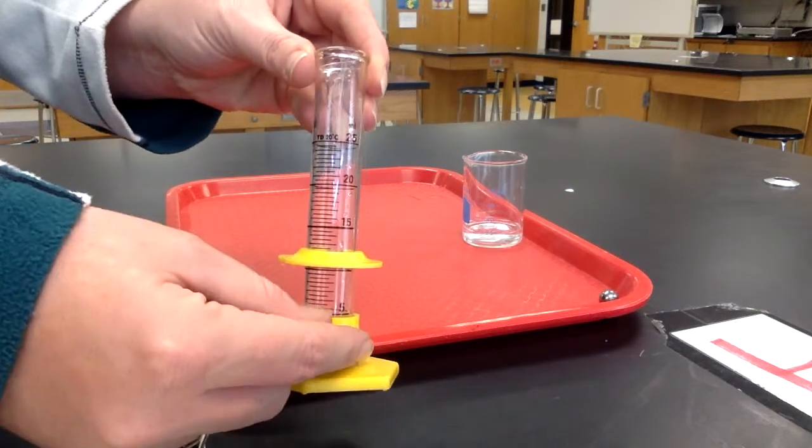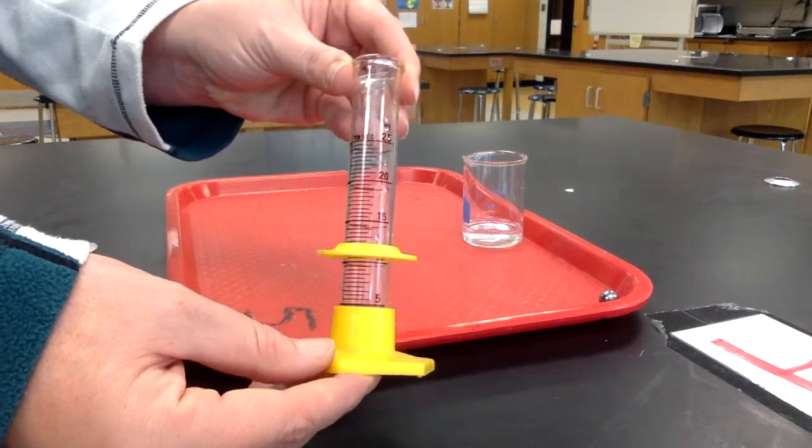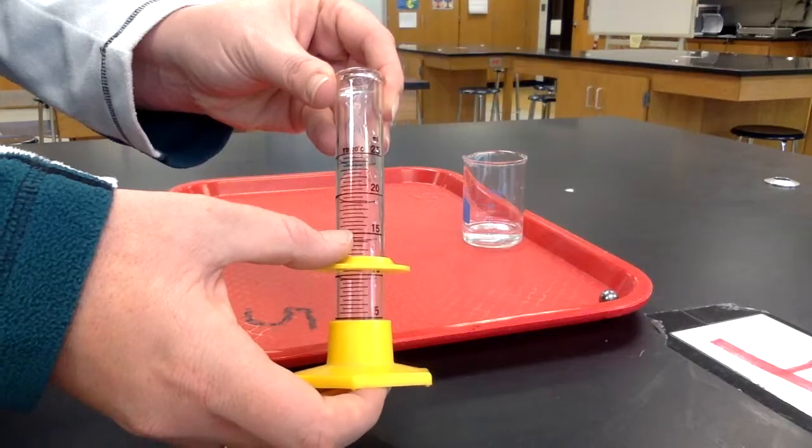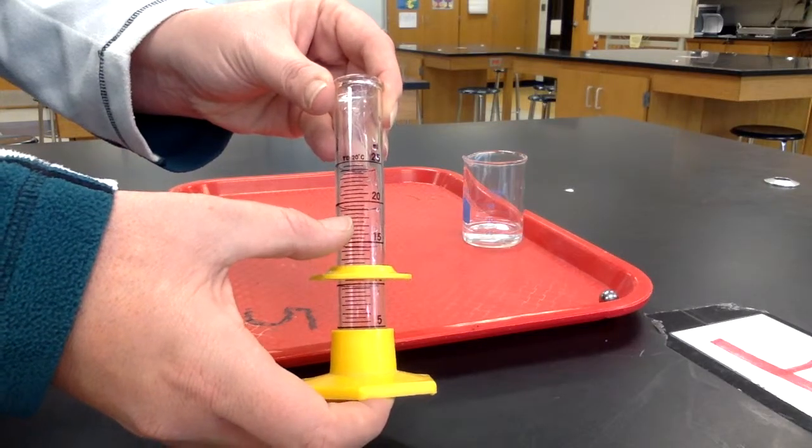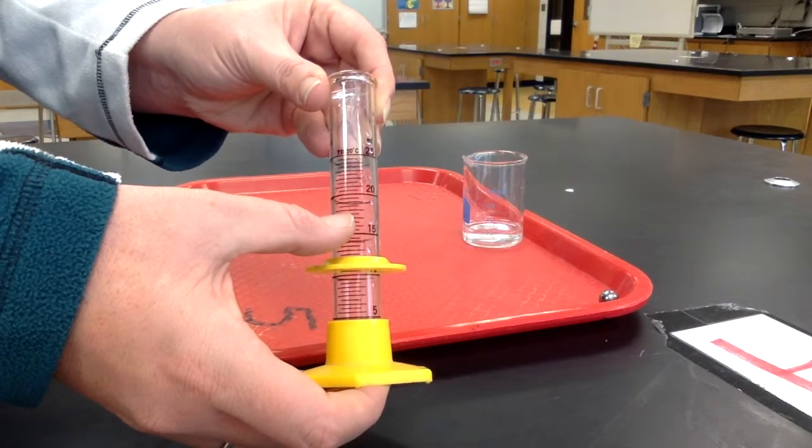The graduated cylinder has a scale on the side. This scale counts by ones or point fives. The bigger lines represent the ones and the smaller lines represent 0.5.